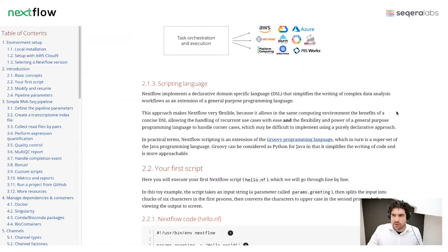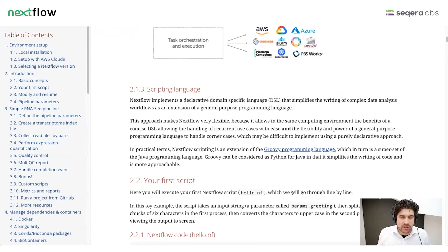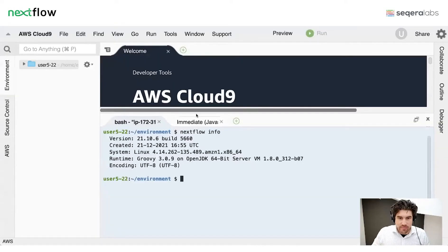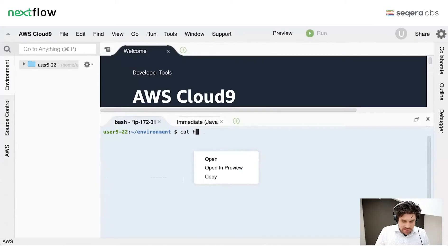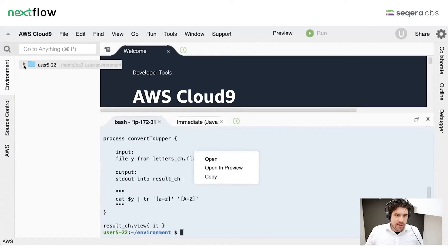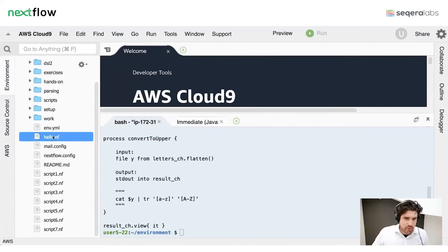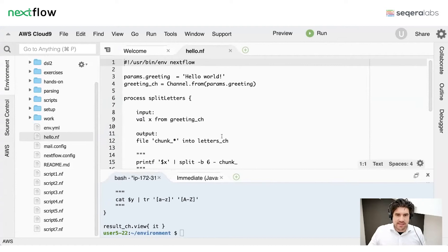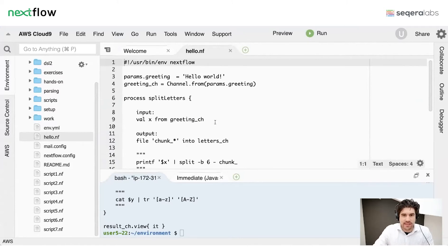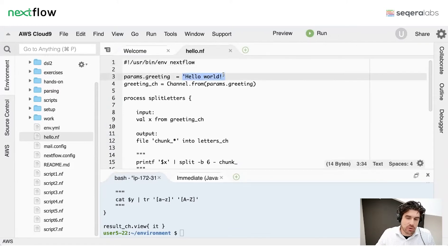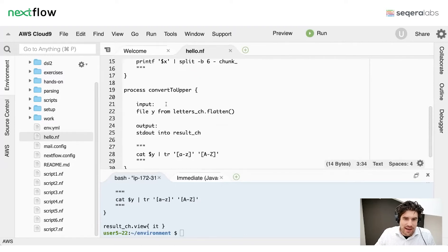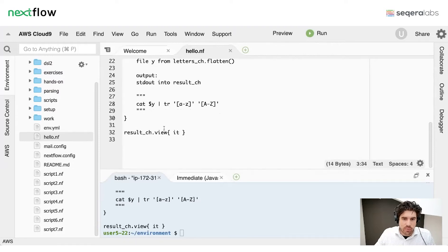We're going to start with a first script called hello.nf. You should find this in your environment — you can see hello.nf is available. If I browse to it on the left-hand side and double-click, we get this text editor. This is an example pipeline which contains a few things: a parameter definition with input 'hello world' as a string, a greetings channel, a process called 'split letters', a second process called 'convert to upper', and then we view the result.